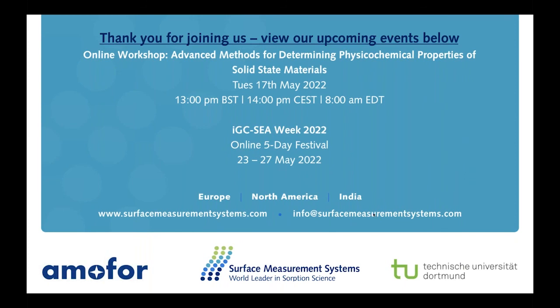Can you repeat that, please, Thomas? Yeah. The question is, for surface energy, would you recommend using the Dorris-Gray or the van Oss (VOCG) scale?